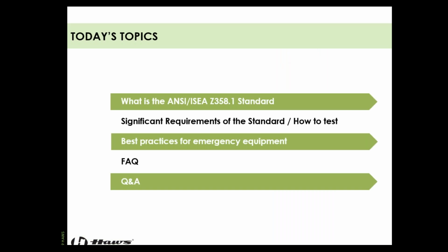On to our topics today. Of course, what is the ANSI ISEA Z358.1 standard? What are the significant requirements of that standard, and what do you need to focus on to accomplish testing inside of your facilities? I'll break those down and simplify that process for you. Best practices for emergency equipment, an FAQ that Hayden's going to cover, and then I'll do the Q&A at the end.